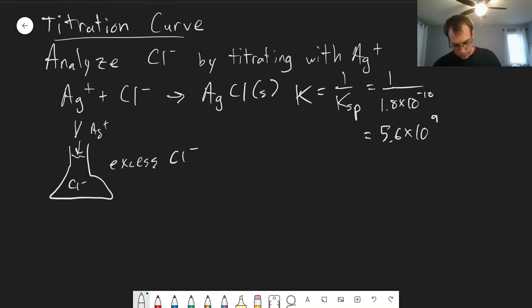As we add silver, silver will react with the chloride and precipitate.